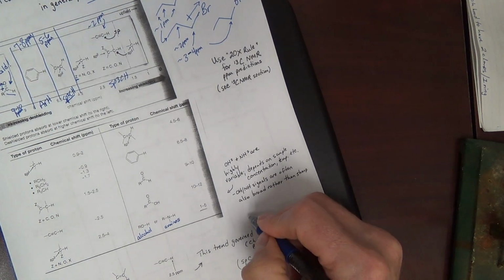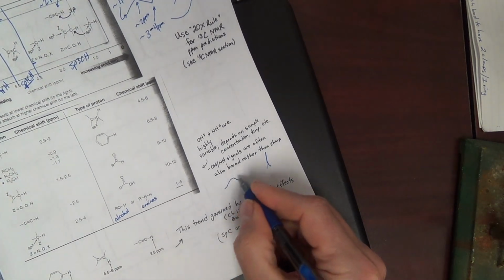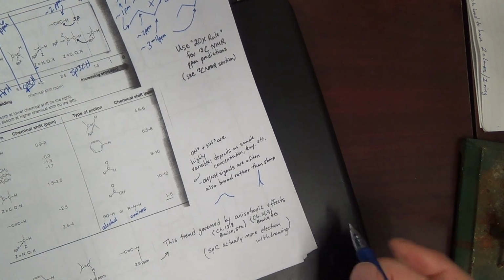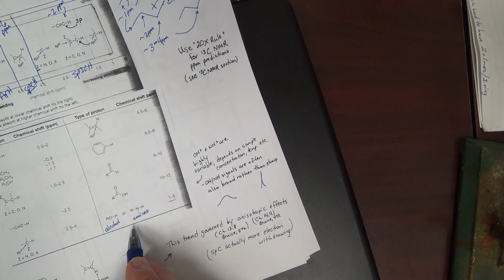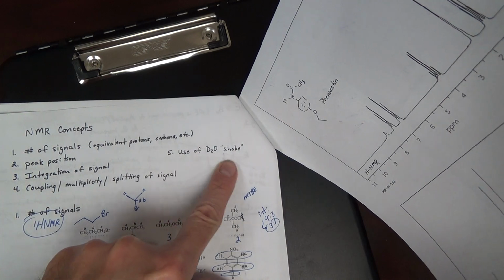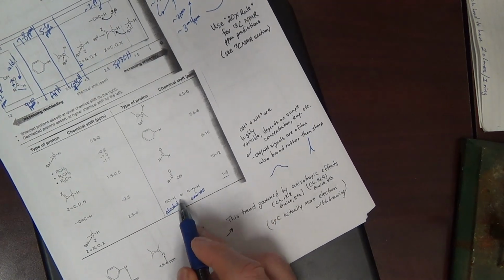So the signal may sometimes be like this as opposed to sharp like that. Broad. We'll talk more about these types. We'll also introduce the D2O shake, which is going to be our fifth concept. The D2O shake will help us determine if a signal is from an OH or NH.